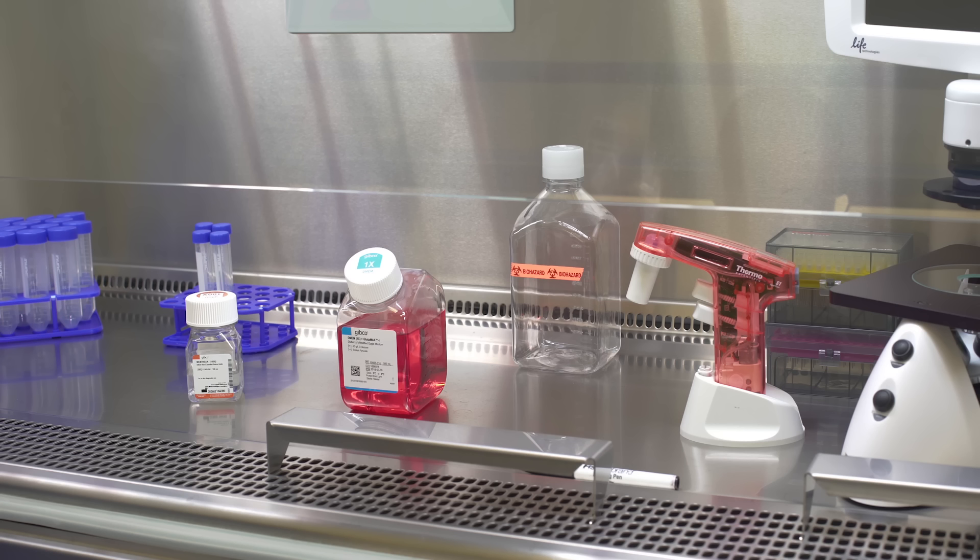Notice how the cell culture hood is set up to make the following actions easier. The pipette aid is on the right side, so you can easily control the pipetting in your right hand. Reagents are in the center back, so you can easily open the bottles and pipette from them. It is very important to have the setup in this manner, so you're not crossing your hands or supplies over top of sterile items.